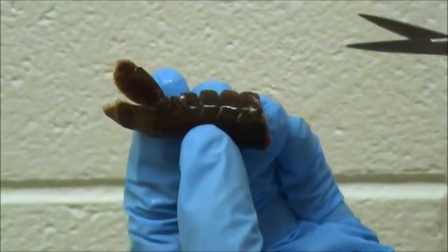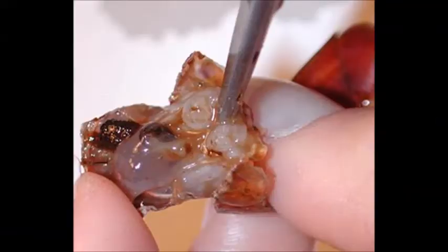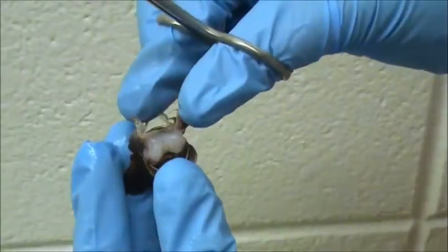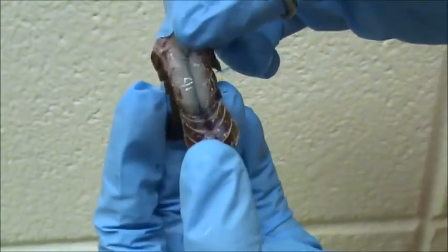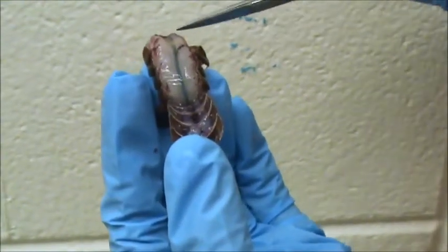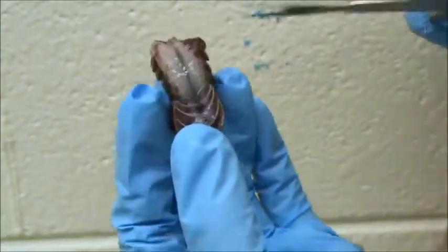So now we're going to cut along that same line on the other side. So what we're going to do now, we're going to pull this up and we're going to cut right along here. And interesting fact, this is actually the GI tract, if you didn't know.